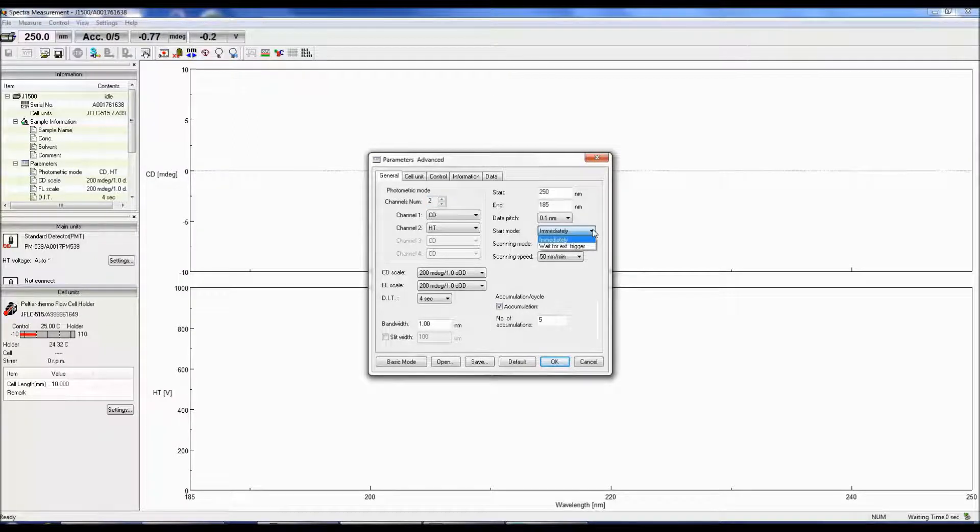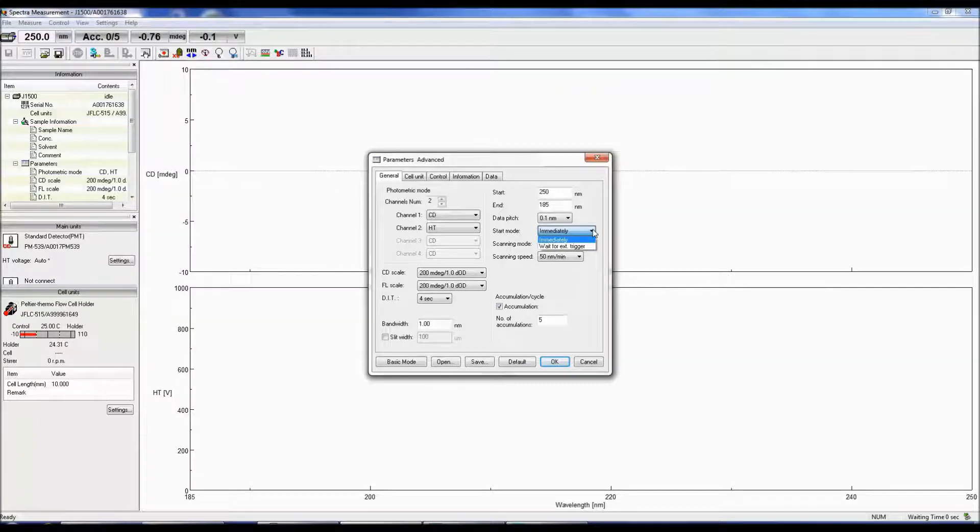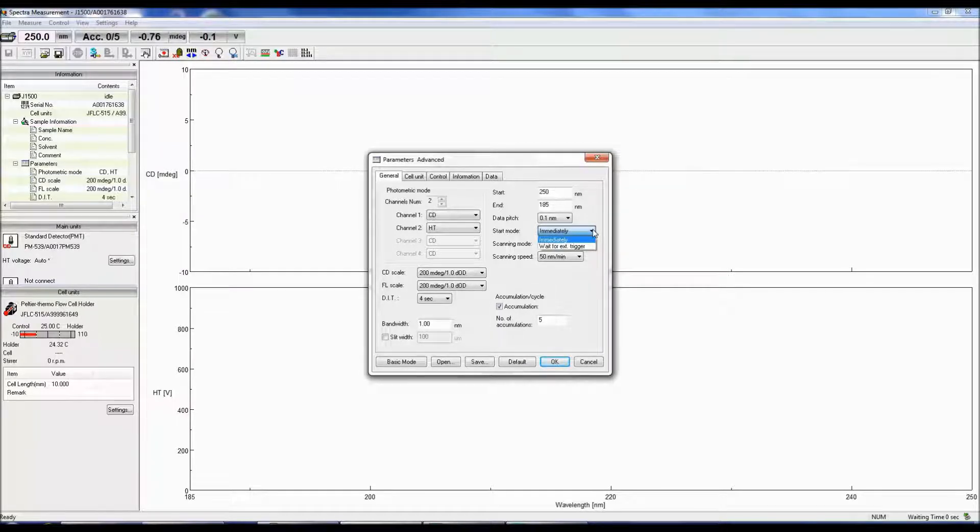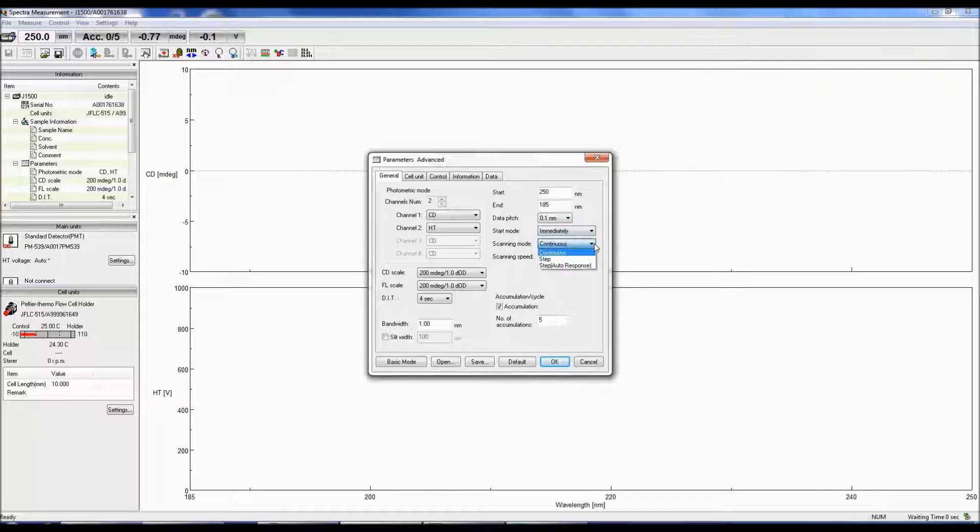The start mode allows you to immediately obtain a CD spectrum or wait for an external trigger. JASCO offers three scanning modes.